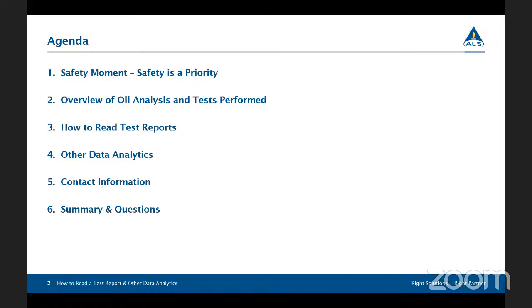Then we'll get directly into what oil analysis is and what tests we do, because it's really important to understand, before we try to read a test report, why we do the tests and what those tests are trying to achieve. Then we'll get into reading those actual test reports. And then we'll get into data analytics, because that's really important as well.